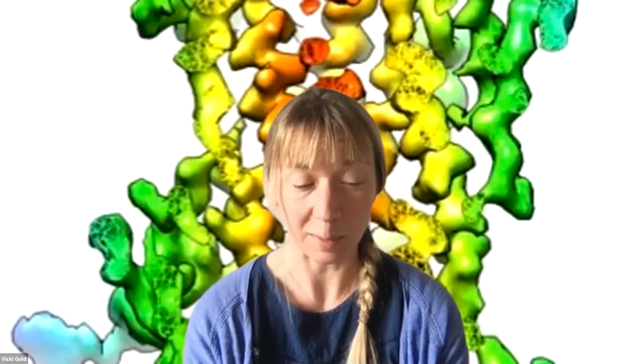There was a question about pipetting the bacteria onto the grids. Did you have to wait for them to reattach before freezing? So actually, in some cases, we just did a slightly different way of preparing the grids, because if you pipette cells with pili, sometimes they can shear off. So we sometimes actually just dipped grids into solutions of bacterial cells, and they then stuck to the surface. We didn't have to wait any length of time. We then just plunge froze them.